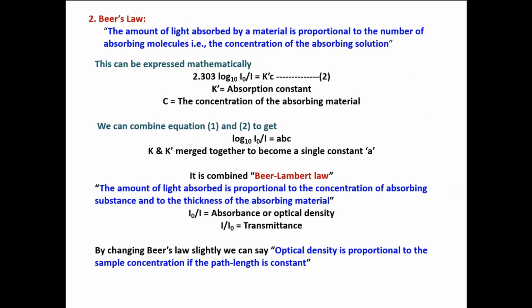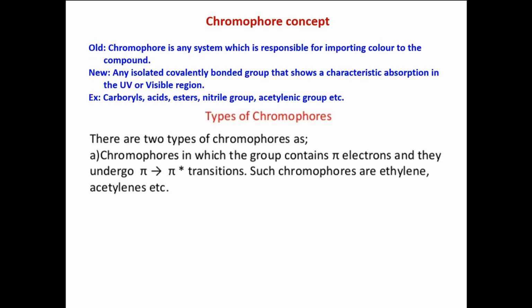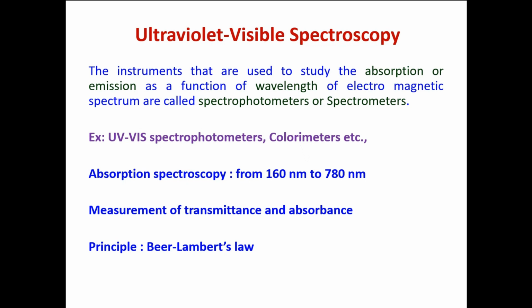You should understand here that the pure state in the sense, chemical molecules, like you can isolate some of the compounds from ores, right? If you isolate the iron, you have to calculate the iron concentration. Then in that case, what happens? We use the spectrophotometer.